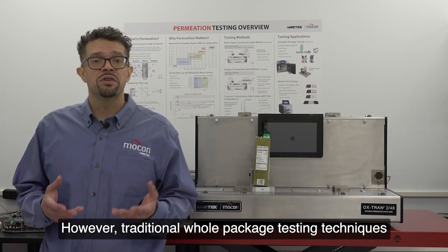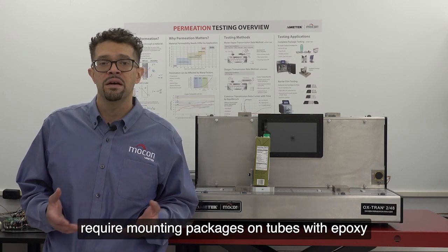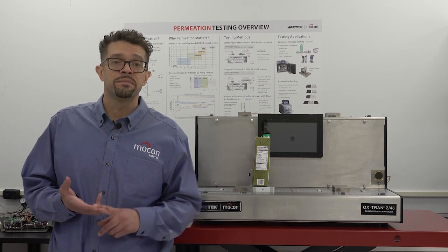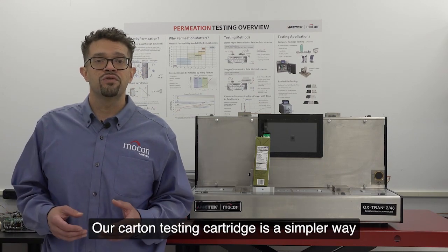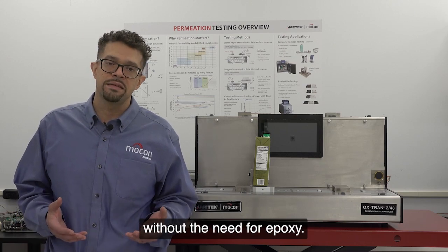However, traditional whole package testing techniques require mounting packages on tubes with epoxy, which can be messy, time-consuming, and wasteful. Our carton testing cartridge is a simpler way of running a whole package test without the need for epoxy.